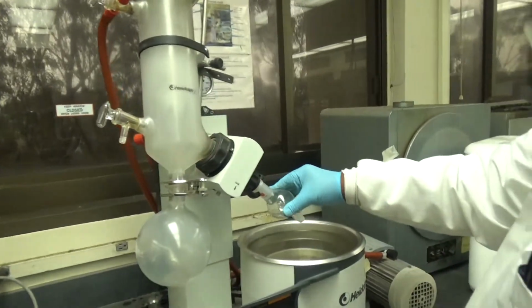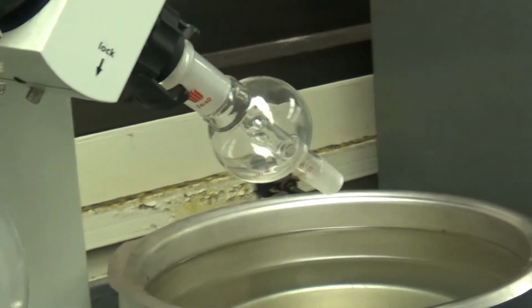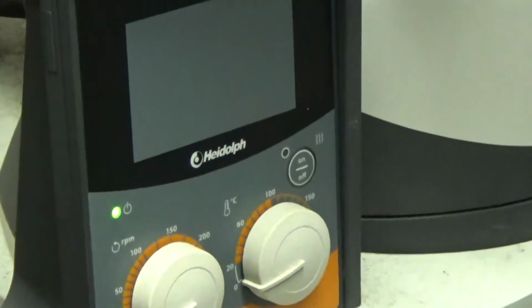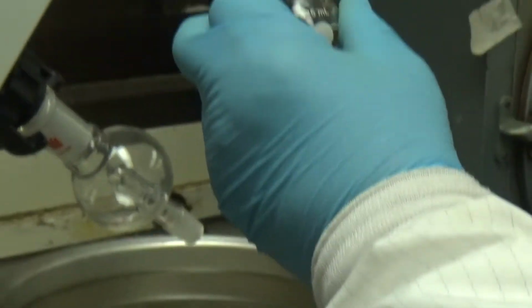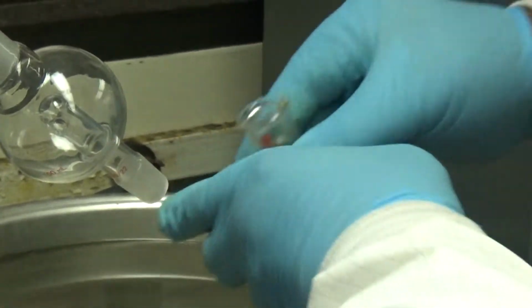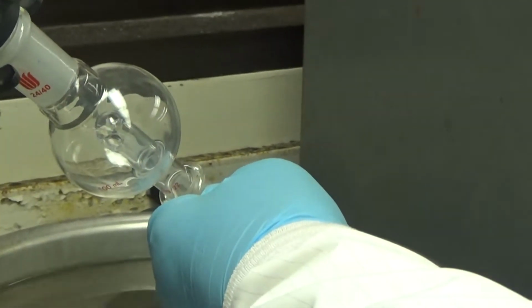Here is the bump trap, which catches the bumps. If it splashes from your flask, it catches that. You need to turn that on here. Okay, switch going on. You have to make sure that the round bottom flask you are going to use has a female glass joint that fits the male glass joint of the bump trap. If it doesn't fit, it won't work. And you need a plastic joint clip, as you see here.